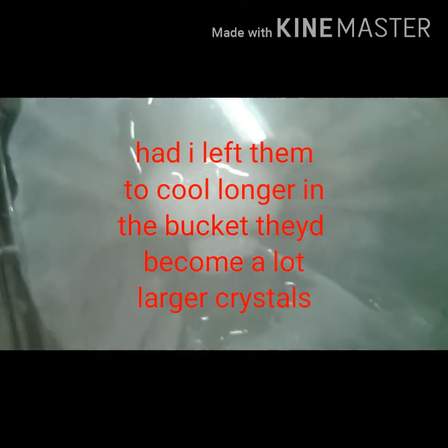I just thought I'd show this real quick. This is what I took out of my bucket before the water even cooled and before I reheated this stuff up, just so you can get an idea of what it looks like now. Nice clear white crystals — kind of salt-textured. Alright, anyway, until next one.